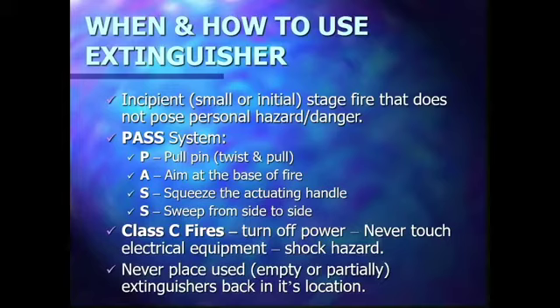We need to firstly ensure that the electrical supply to the equipment is cut off. Then only we extinguish the fire.